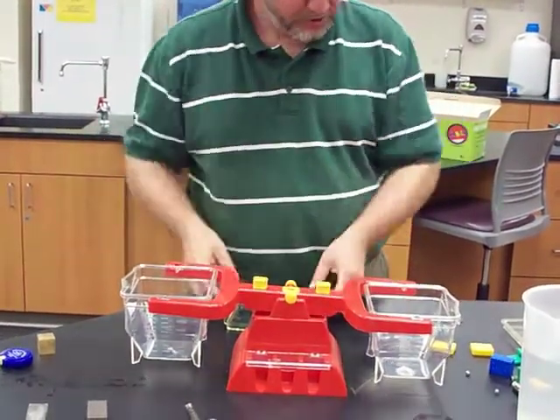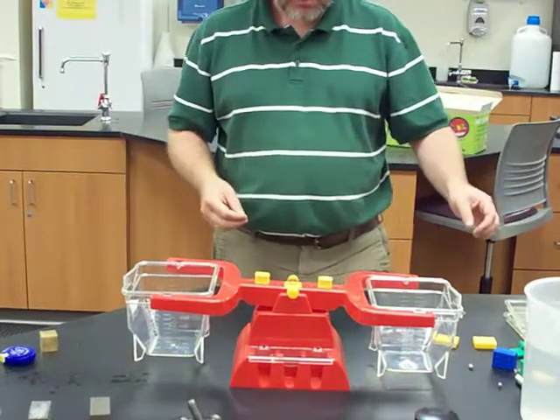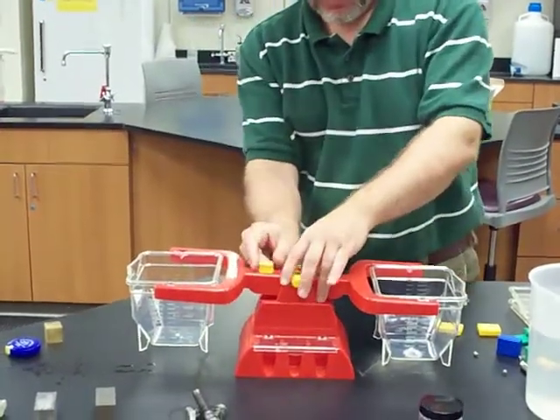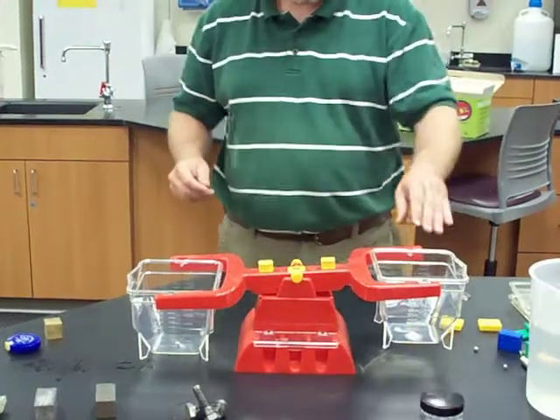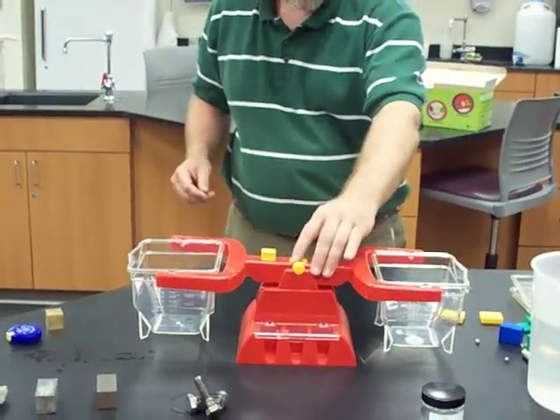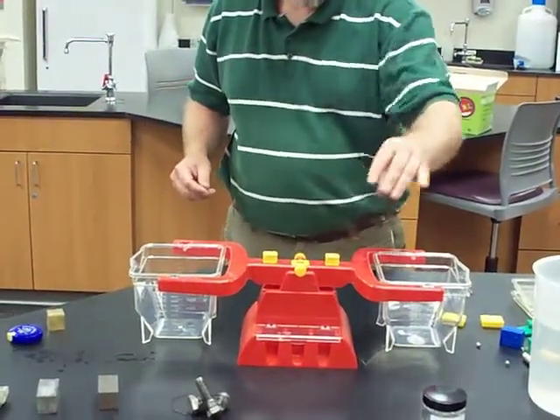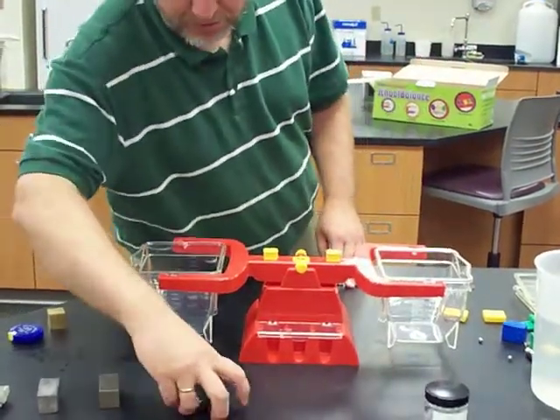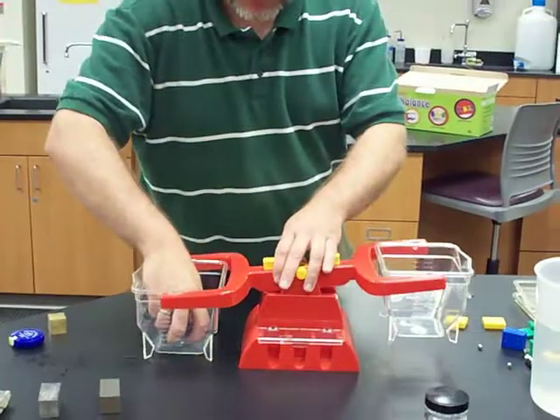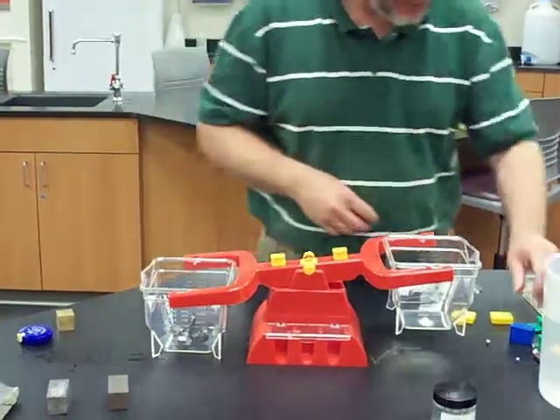Totally horizontal, is it? A little bit better, right? Like that. Looks okay to you? I think so, right? Okay. I'm not going to slip.